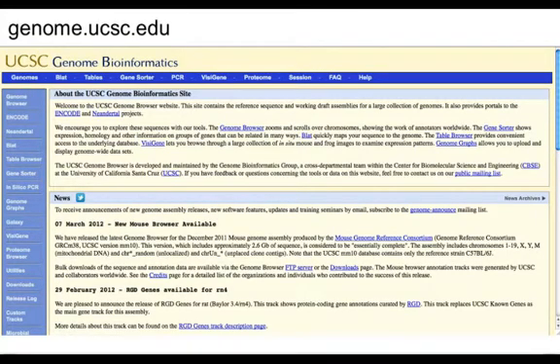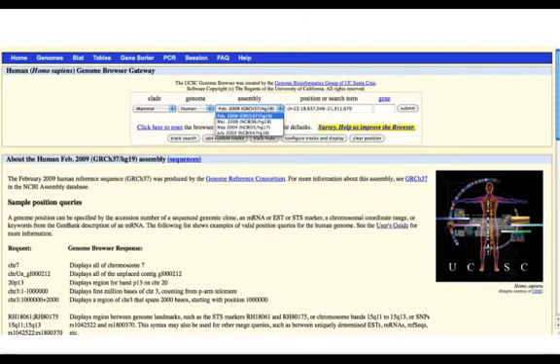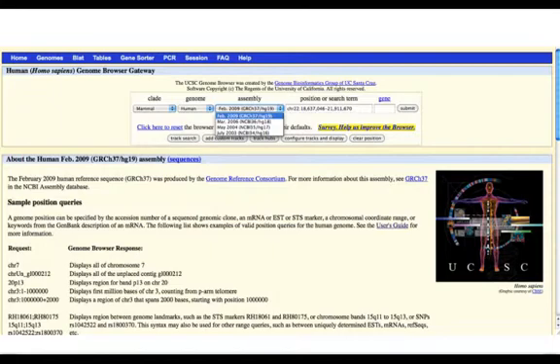First go to genome.ucsc.edu. From this page, you want to click on Genomes in the upper left-hand corner. That will bring you to a page where you will input the information regarding your patient's microarray abnormality. That goes under the Position or Search Term tab.